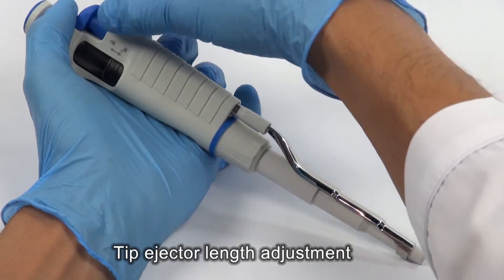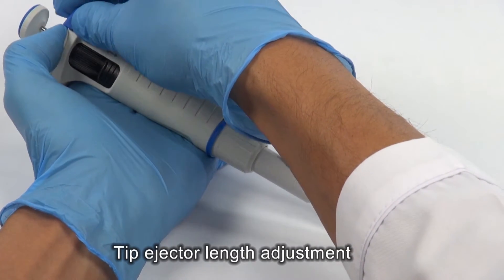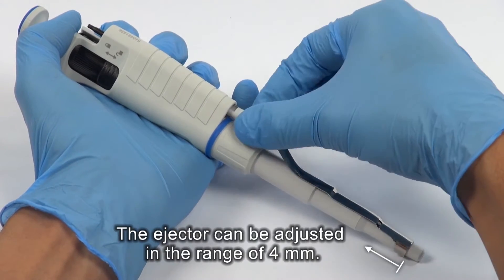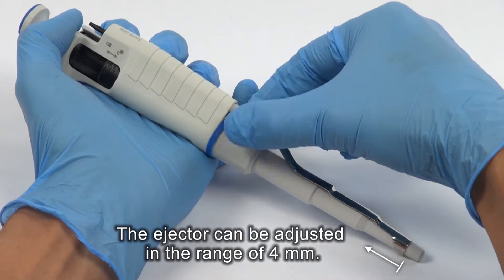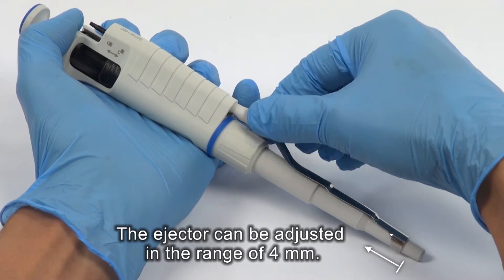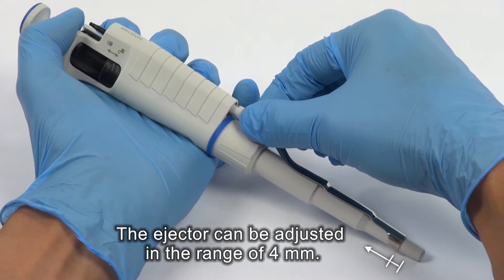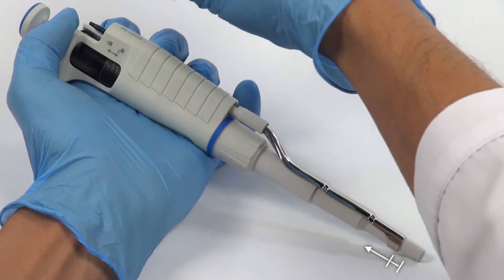Remove the tip ejector button. Turn the ejector bush to the right to shorten the ejector. Fix the tip ejector button.